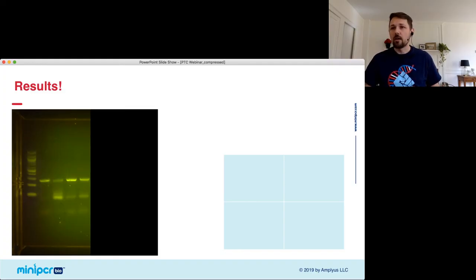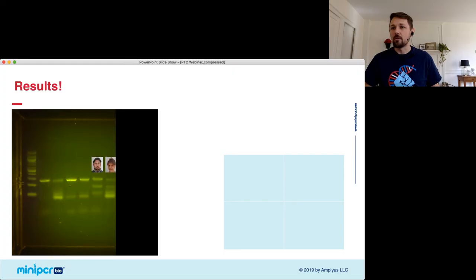So let's look at who these people are and what it tells us. So dad and mom.